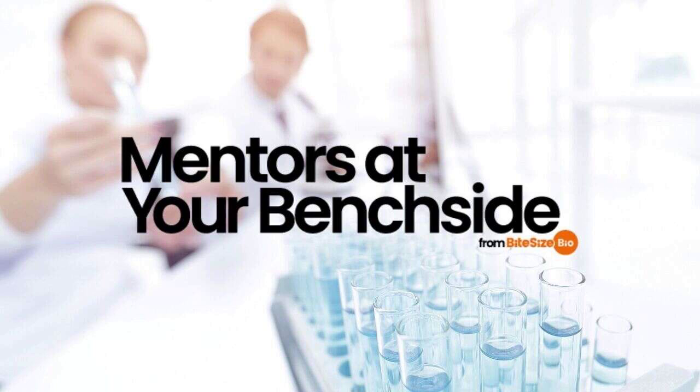Can I use Ponceau S stain after the blocking step? You should perform Ponceau S staining before the blocking step. Since Ponceau S is a non-specific protein stain, it will also bind to blocking agents such as BSA or proteins in milk. Therefore, the results will be more accurate and helpful if you perform the staining before blocking. Is Ponceau S dangerous? As always, consult the material safety datasheet before using any new chemical. Use standard lab PPE when working with Ponceau S, as it can cause skin, eyes, and respiratory tract irritation.